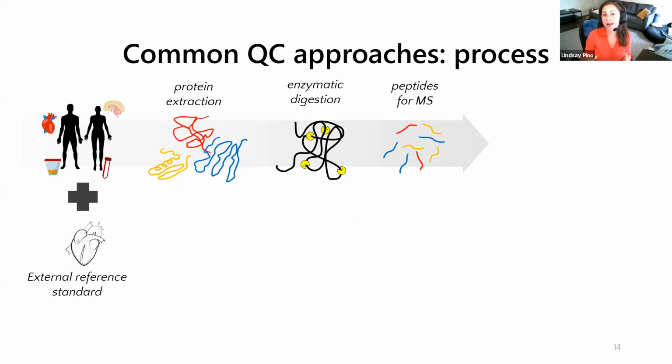So if I'm doing a cardiac tissue project, I would take some big pot of cardiac tissue, either small amounts collected, aliquoted off of each one of my experimental tissues, or looking into repositories like NIST, the National Institute of Standards. They might have different types of external reference standards that they have extremely thoroughly QC'd and validated. You purchase those, you prepare your 10 samples, and you add this one extra external reference standard.